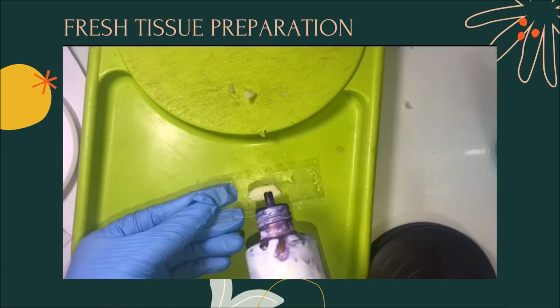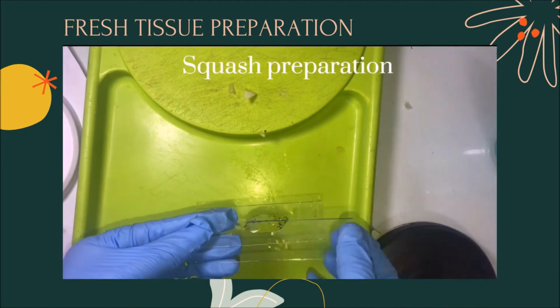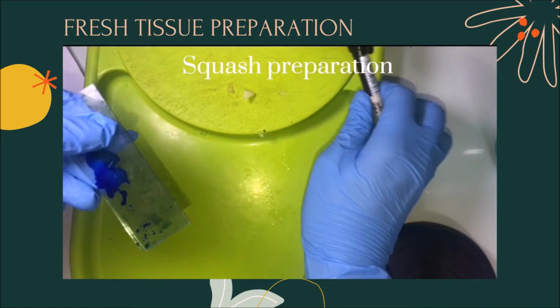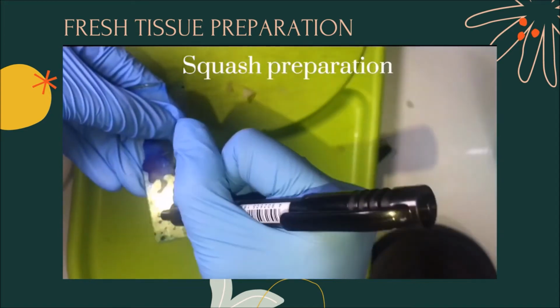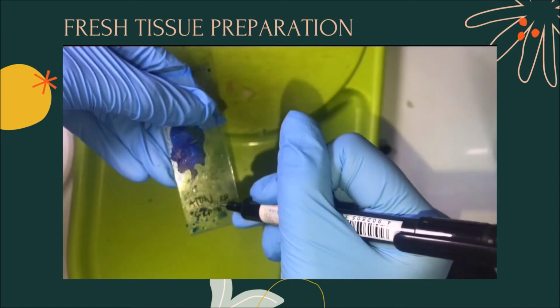For the squash preparation, add 1 to 2 drops of methylene blue stain directly on the tissue slice, and cover the stained tissue with a cover slip or another glass slide. Then, apply enough pressure to crush the tissue flat. Label your slide with your name, group number, and section.